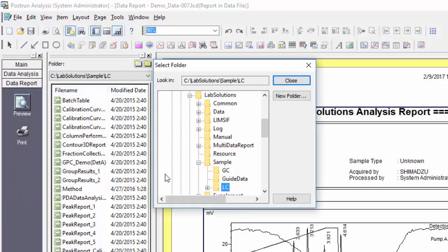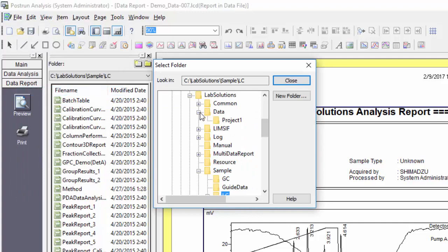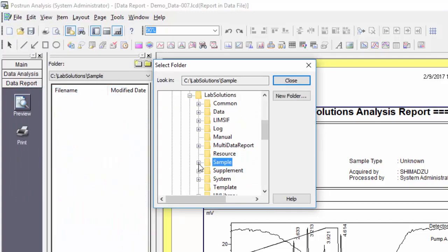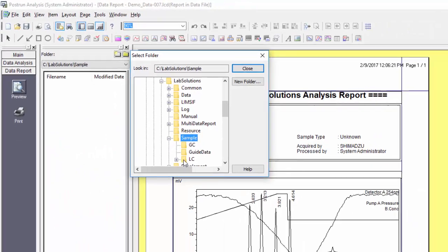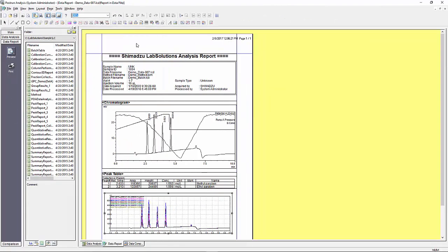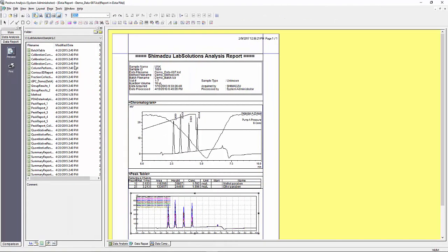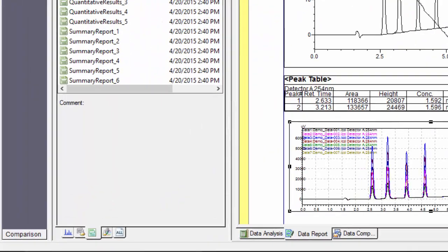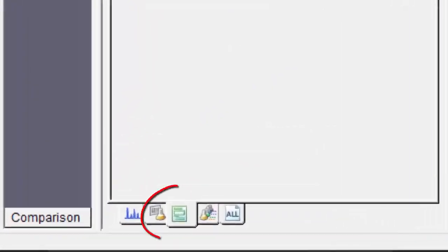Shimadzu also provides some pre-made report templates for you to start with. You can find these templates under the LabSolutions folder sample folder LC folder. Once you have selected that project folder, notice now all the available report templates in the data explorer window. Make sure you have the report templates tab selected at the bottom of the data explorer window if you don't initially see them.